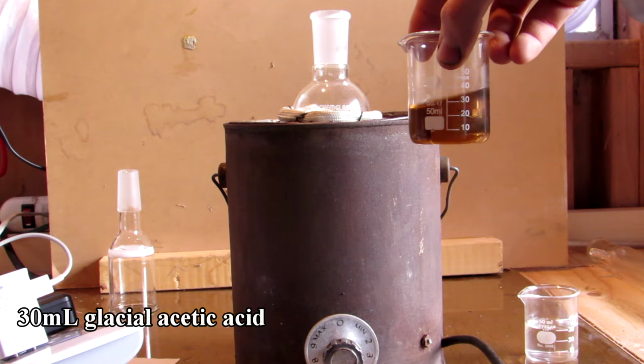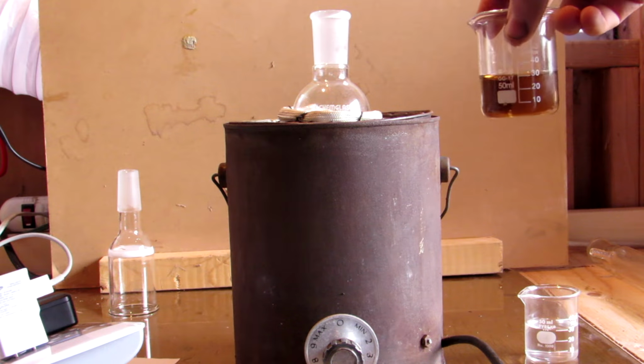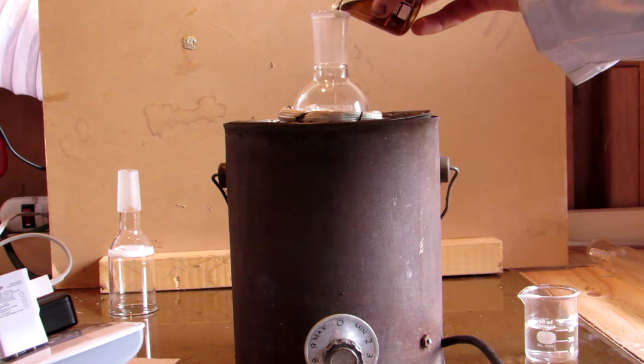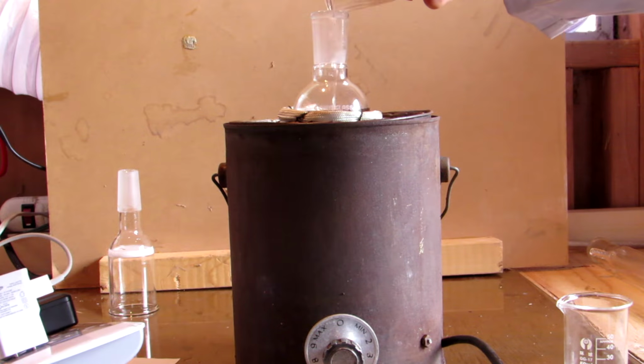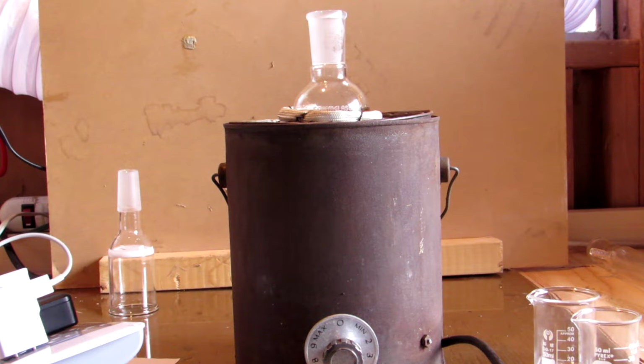It has become a bit discolored over time as it is quite old, but it will work fine as the final ethyl acetate needs to be distilled to purify it anyhow. This is added to a 100 milliliter round bottom flask, followed by 30 milliliters of 95% ethanol. The ethanol can be purchased in some rubbing alcohols, or it can be fermented and distilled as I showed in a previous video. Usually an excess of alcohol is used in a Fischer esterification to drive the reaction forward.